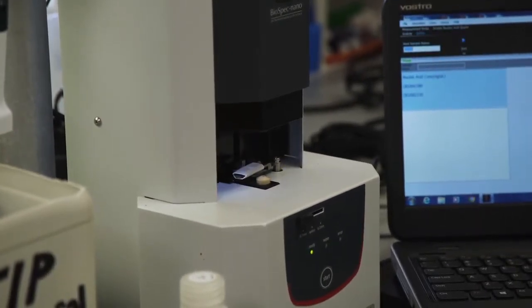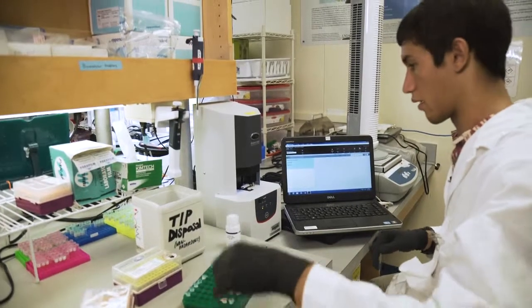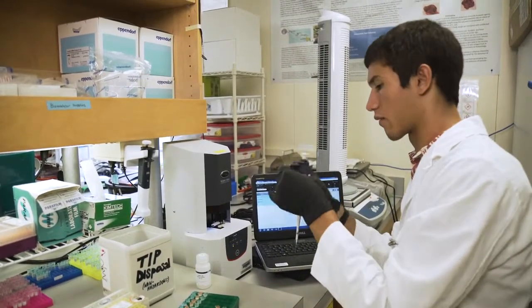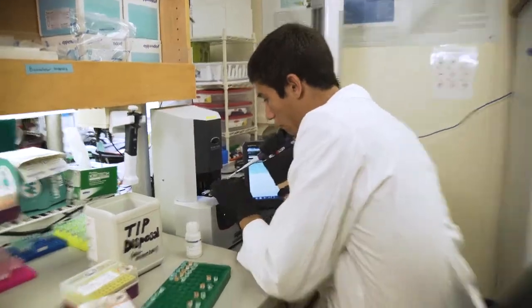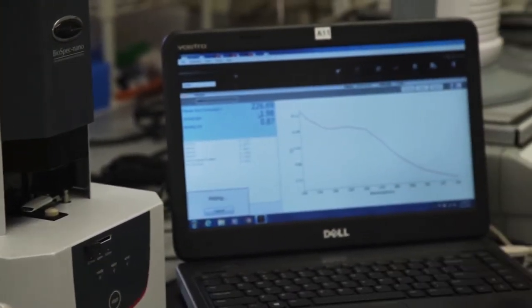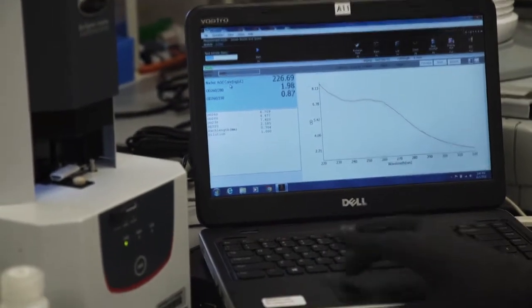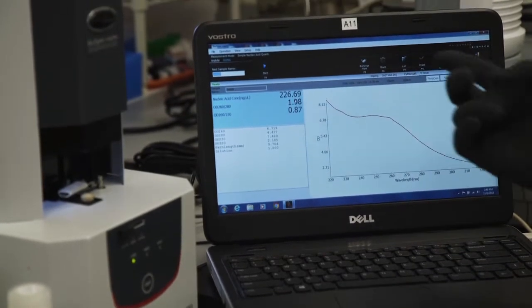So with the blank set, there won't be anything up on the screen just yet. We punch in our sample name, 24009, since that's the number we're doing first. And we grab our pipette tip and our sample, and take our 3 microliters of what's hopefully a good bit of DNA. And then you cross your fingers. And we get this nice curve. The nucleic acid concentration, so that's what the NA in DNA stands for, is listed here. And that's a very healthy concentration. That's pretty great, so that makes me happy.